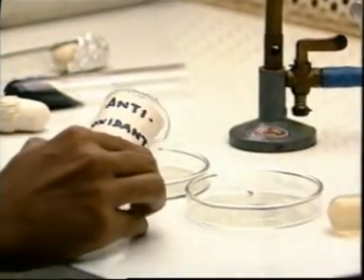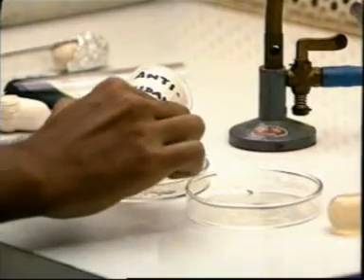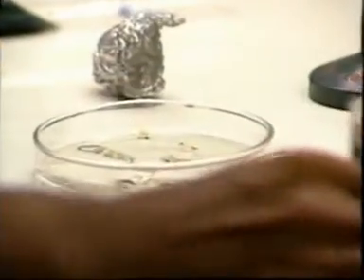What are the steps that should be taken to prevent this browning? Now, browning can be prevented in 2-3 different ways. One is by dipping the explants into antioxidants. Antioxidants that we use are ascorbic acid, cysteine, citric acid, glutathione, etc. All these are reducing compounds. So they are used, and taking a proper concentration, explant tissues are dipped into this solution for some time, and then they are inoculated into the media. Sometimes it is necessary to have these antioxidants incorporated into media also. For example, that's what you are doing, I believe, with your date palm cultures.